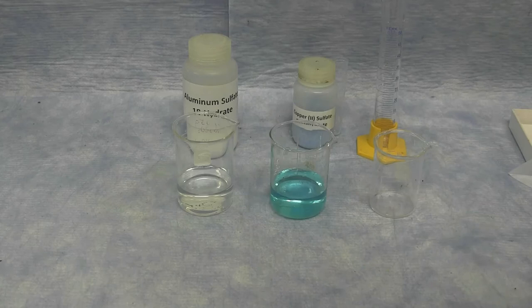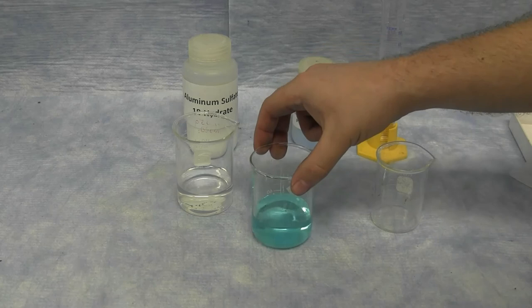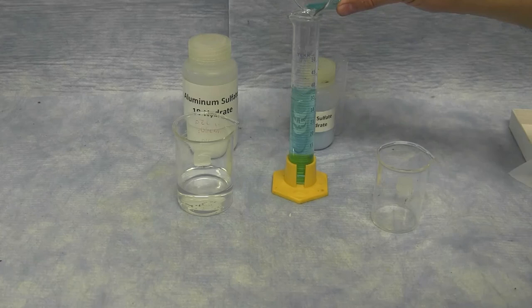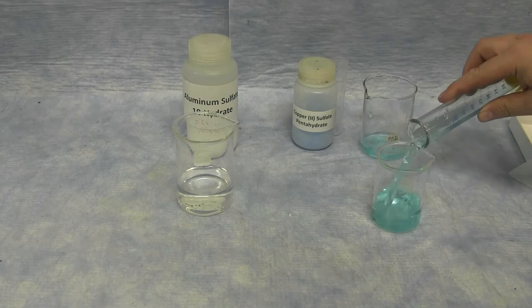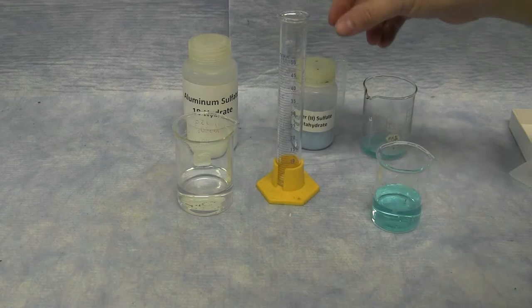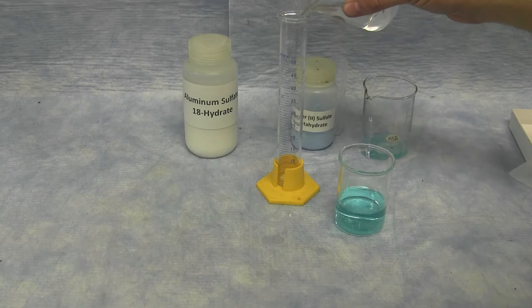The third solution that you'll be preparing is a combination of your two prepared solutions. You'll take between 10 and 40 milliliters of one solution, and place that in a small beaker, and then determine the difference of the solutions for a total volume of 50 milliliters. In this case, I used 40 milliliters of the copper sulfate solution. Therefore, I would use 10 milliliters of the aluminum sulfate solution. So there is a total volume of 50 milliliters.